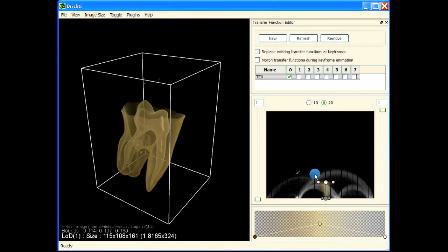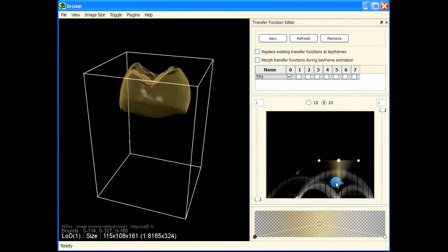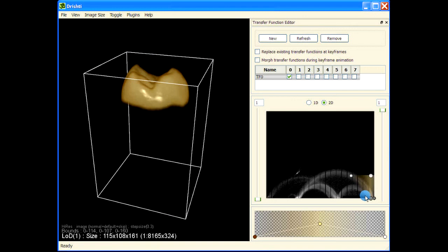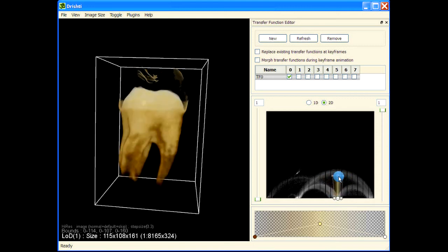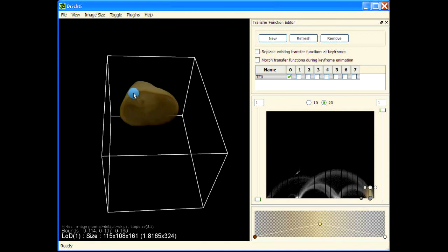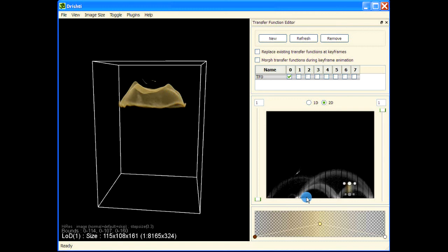This arch here is an interface between this phase and the last phase, so if I move my transfer function to just catch the arch I'm going to get the boundary between the air phase and this high density region. This is the air phase and the high density region, and we are catching the interface between them. There is another boundary here between this middle density phase and the high density phase.